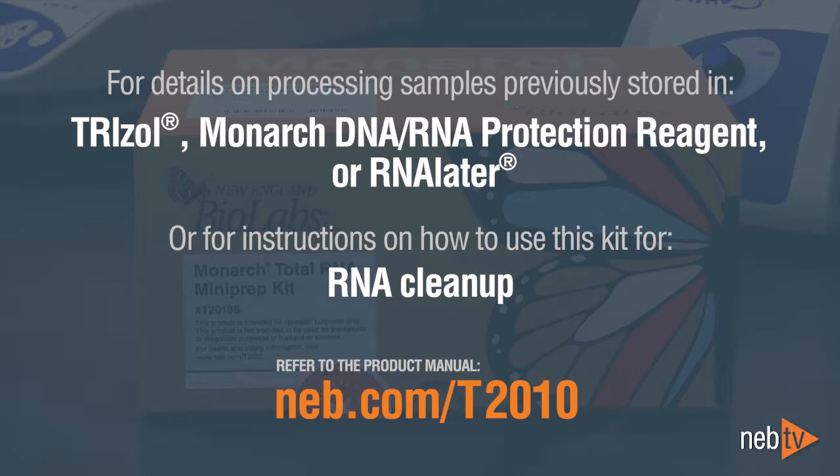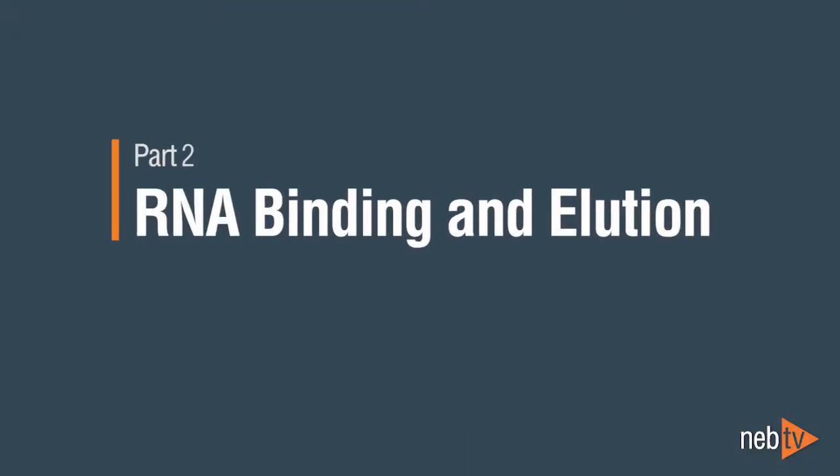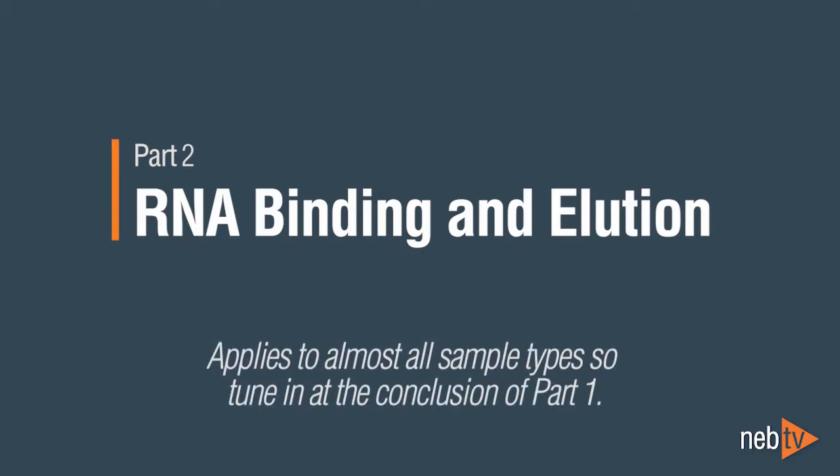For details on processing samples previously stored in TriZol, Monarch DNA RNA Protection Reagent, or RNA Later, or for instructions on how to use this kit for RNA cleanup, please refer to the protocols in the product manual, which can be found at neb.com/T2010. Part 2, RNA binding and elution, is almost identical for all sample types, so after viewing your specific protocol for Part 1, please tune in to Part 2.